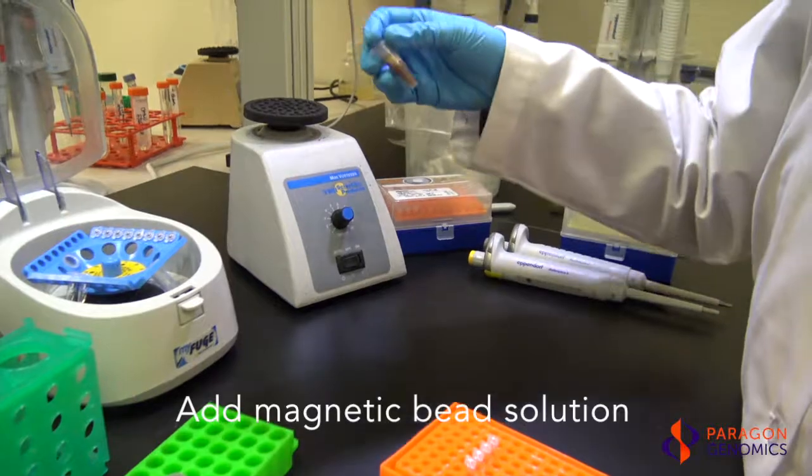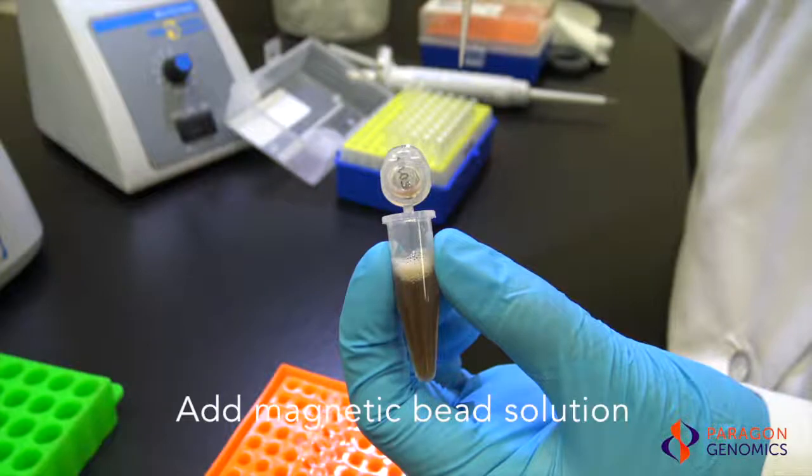First, add an appropriate volume of CleanMag magnetic bead solution to each sample. The volumetric ratio of beads to sample is 1.3 times for the first two purification steps and 1 times for the last purification step.